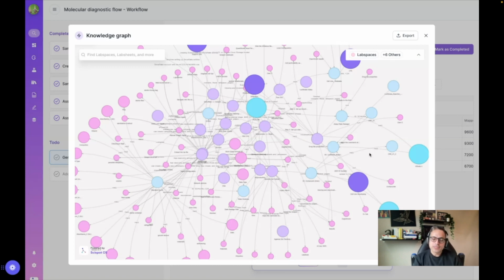The other advantage is, if you're building a proprietary database, let's say you're building an LLM infrastructure, one question I've heard is, can I train that with these graphical ontologies? So Scispot has an API endpoint. You can check that on docs.scispot.com. I'll put a link in the chat as well.